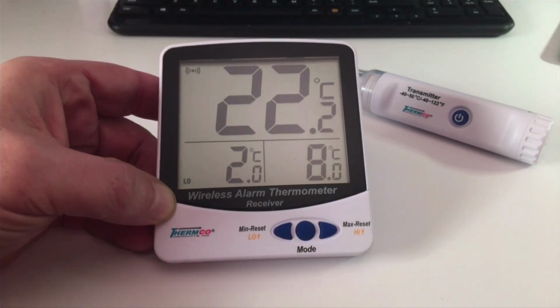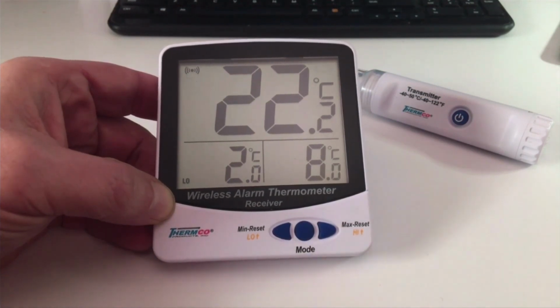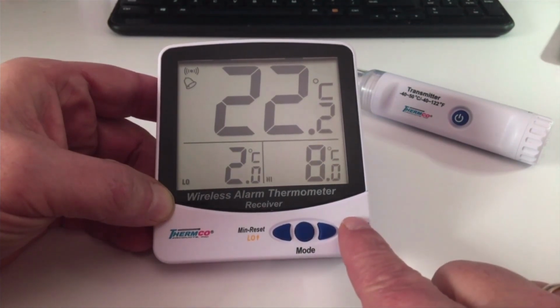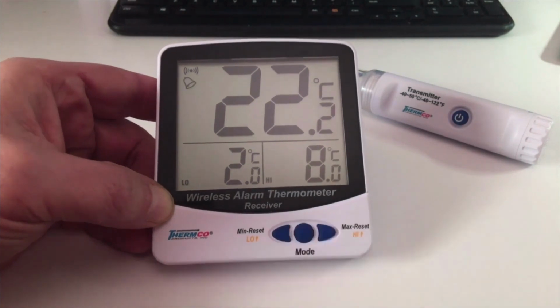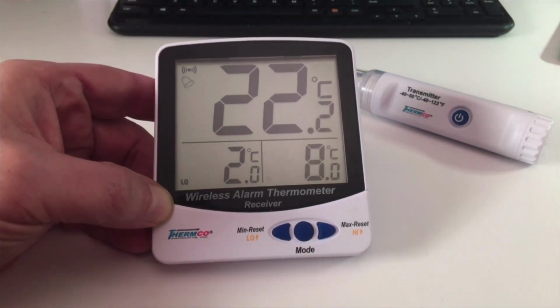We have an alarm because the temperature sensor is at ambient room temperature. You'll see that you also have now an LED that blinks for the alarm, and also an audible that gives about 10 beeps and goes silent, and then 10 beeps. And once again, if you want to silence it, just press any button once and that will silence the audible alarm.